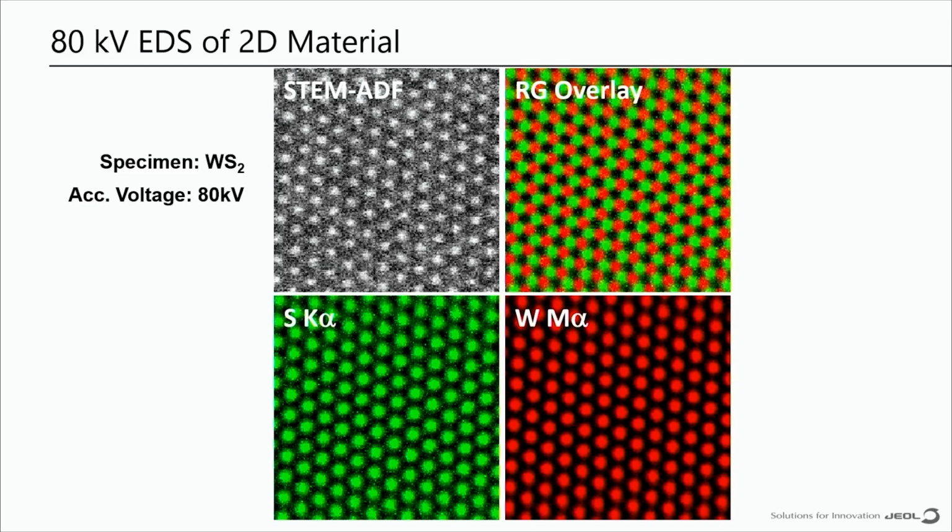We could take that same material and do the chemistry of it. So just our straight images that we were just showing, plus EDS. So using large angle EDS systems, I'm not going to go into details. There's a number of different systems out there that can be used now. But we can, again, do this on an atomic level, do this without degrading the sample.